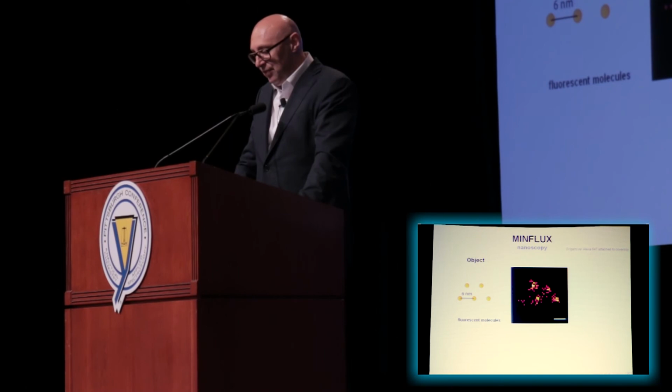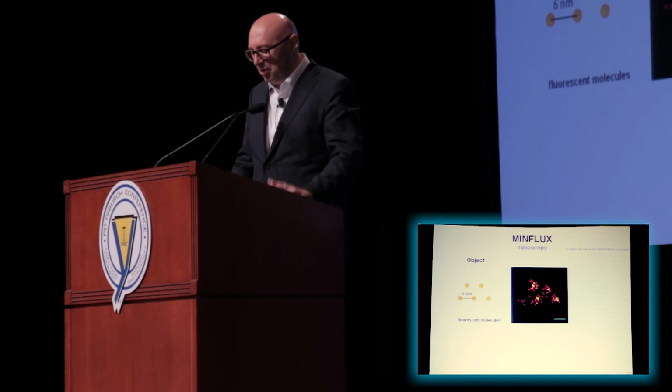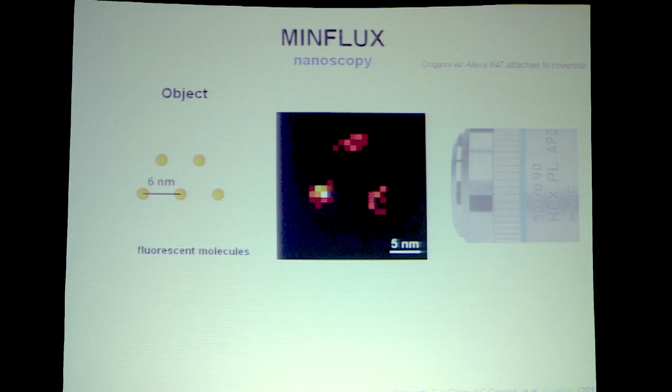And 20 years back, people would have said, "What? You want to resolve molecules that are 6 nanometers apart with focused visible light, and there is no dependence on the wavelength? Come on, you must be crazy." But this is reality. It is like that. We can image at a resolution that is down to the size of a molecule and with no wavelength dependence. That's it. And don't forget, it's done with regular objective lenses, with focused visible light.